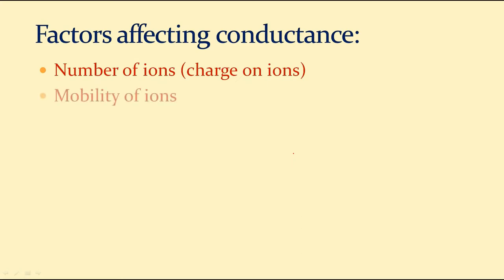And the second one, mobility of the ions. So when mobility is high, the movement of the ion is more, and the conductance is also more. And temperature: when we raise the temperature, the kinetic energy of the molecules or particles in the solution increases, meaning their vibration or movement in the solution increases, so conductance increases with the rise in temperature.